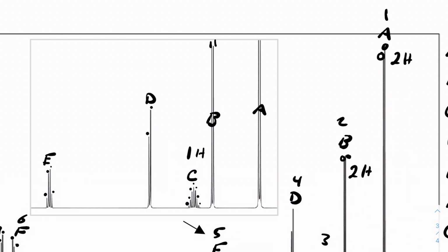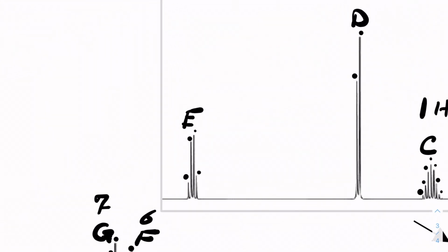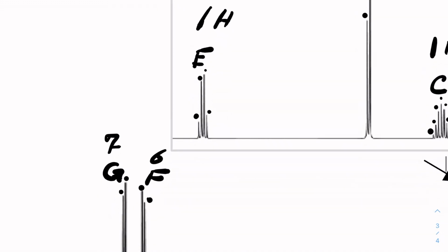So what we see on D is we have 2 hydrogens again, so that's going to be a total of 4 hydrogens exhibiting there, but in 2 separate places within the same area of our molecule. They're all exhibiting the same, but there's going to be 4 of them. And then what we see at E is that there's going to be 1 hydrogen exhibiting a quartet.